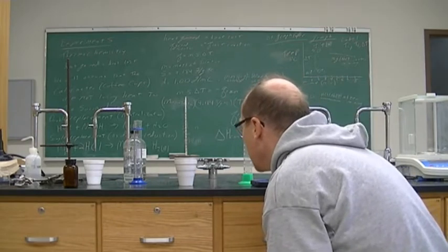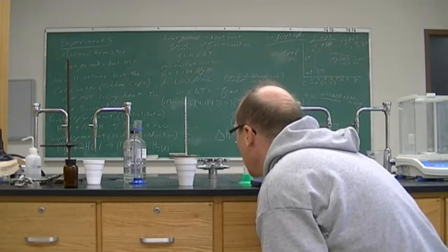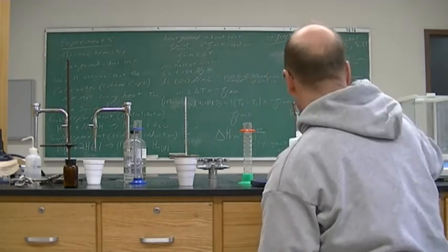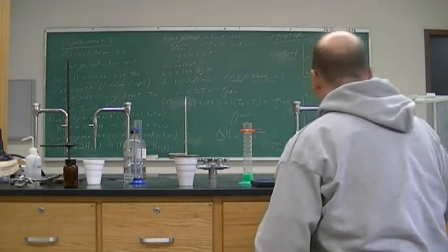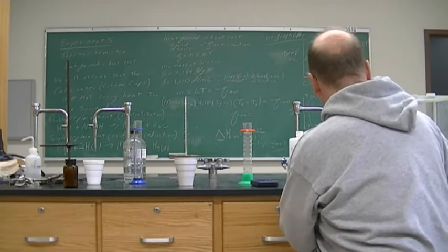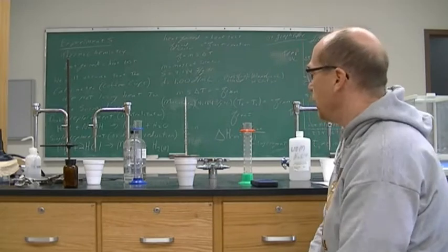It is still not changing at all. And so it looks like we're going to be stuck at 24, even at the 3-minute mark. It is still 24.0 at the 3-minute mark. All right, and so that is enough data for this one. It's not going to change.